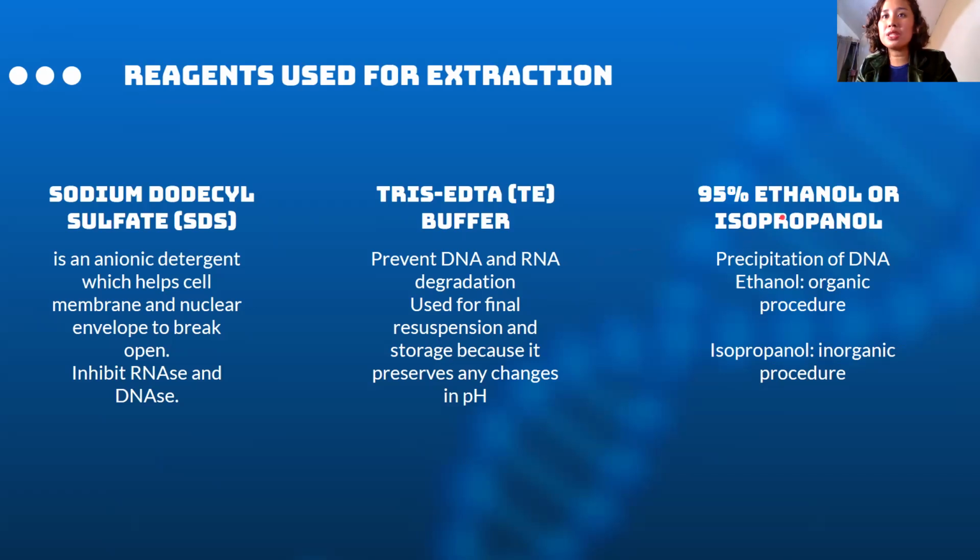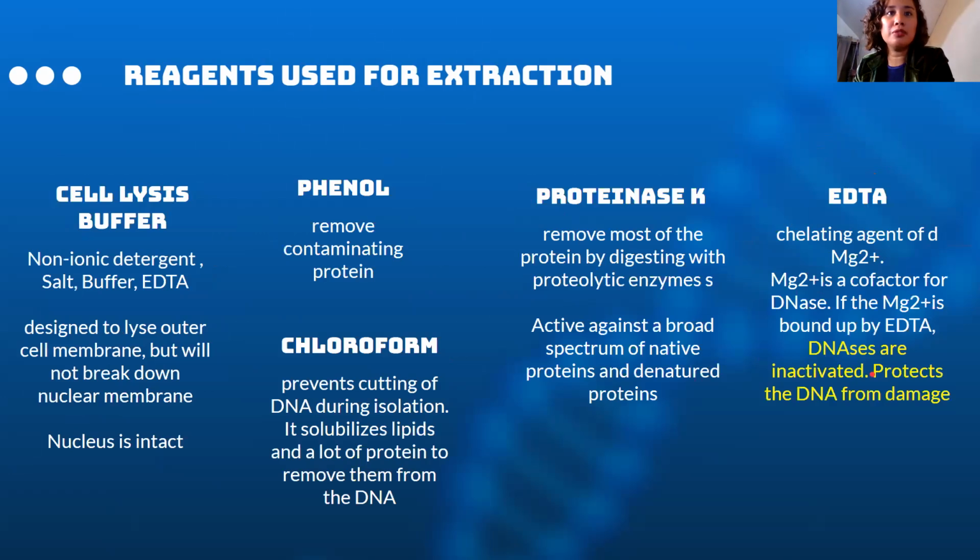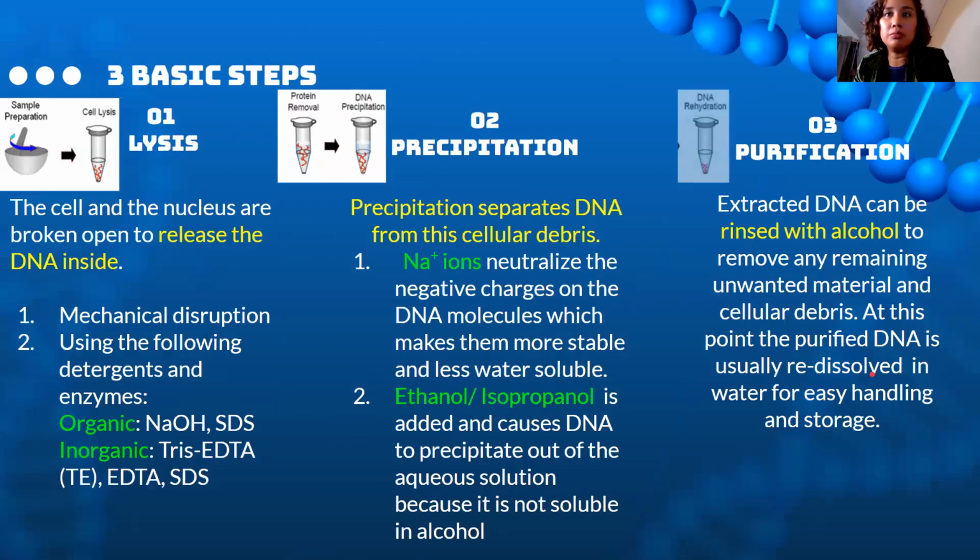So 95% ethanol and isopropanol, they are also used in precipitation. So ethanol and isopropanol, for inorganic precipitation, while phenol and chloroform, organic precipitation. Ay, ganun. Ethanol, organic. Isopropanol, inorganic. So, phenol also.